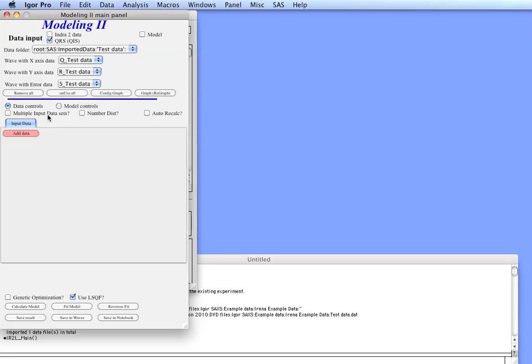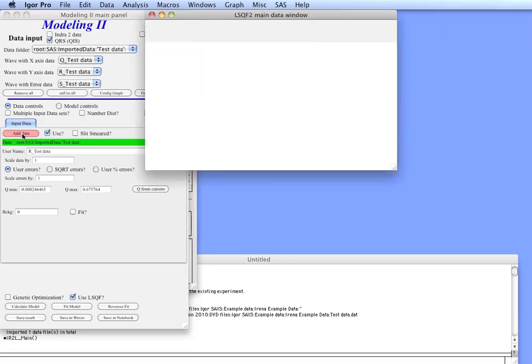For simple use of one data set just leave it unchecked and add the data.